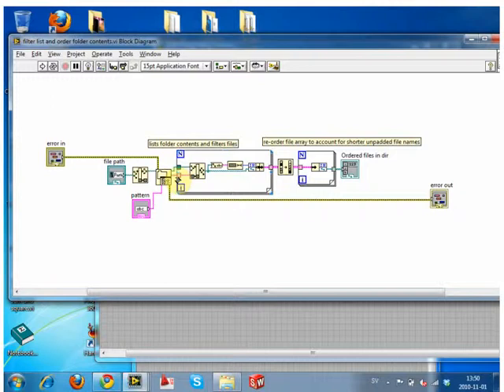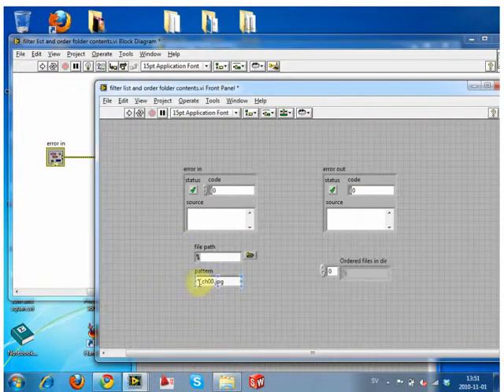Then when we go into the for loop like we have before, we've been incrementing the file name, so we've been indexing the files. But at this point they're in an arbitrary order, whatever order it fancies naming them. There's no particular order. But this is applying a pattern to it. Here we've selected only files which end in _ch00.jpg, and those will go into this list.